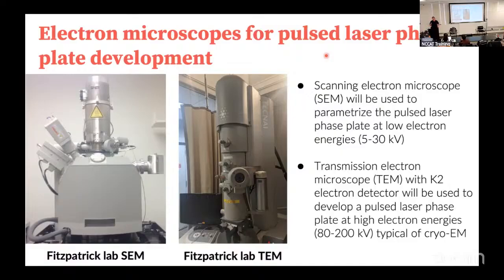So when we started this grant, we only had about 2.5 years, and so we knew that there was very little chance that we were going to be able to do this on a TEM, because getting into a TEM is a lot of work. It's a much higher vacuum. I mentioned the bore. To get to the actual electron beam itself is very difficult because you have a huge amount of lead and other stuff on the outside of it.